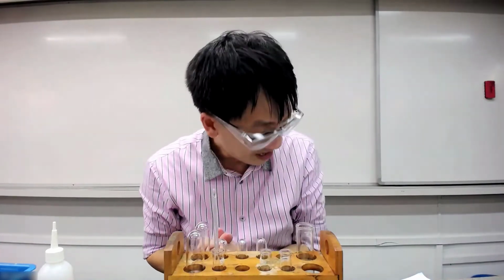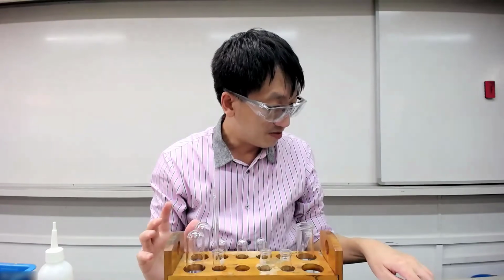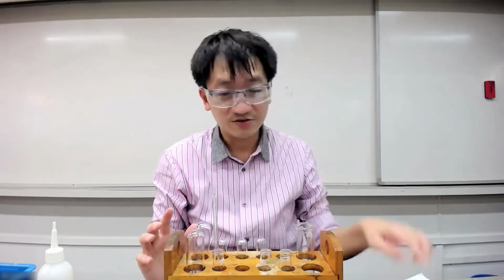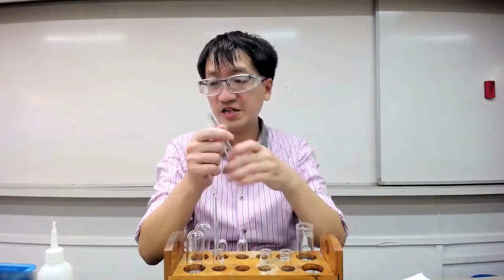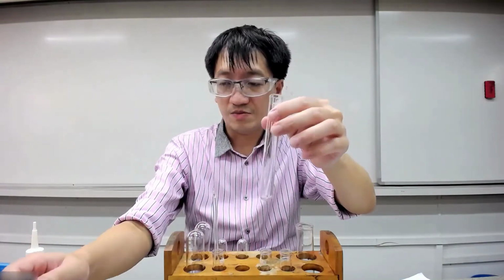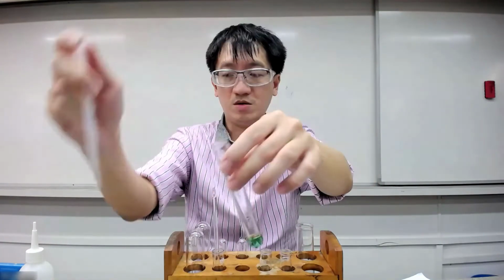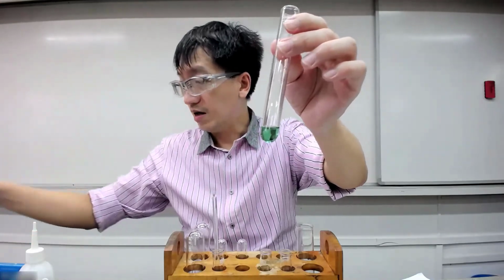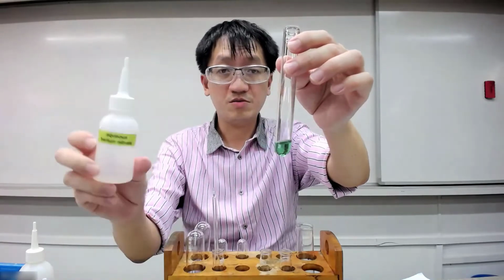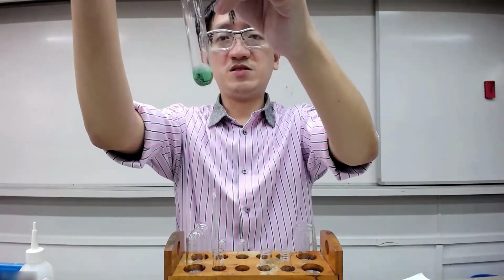Okay, so now for F part 2. Fa1 again, and then I'm supposed to add aqueous barium nitrate, and then add dilute nitric acid. So again, I'm going to add Fa1, then barium nitrate. So barium nitrate is over here. I'm going to add it dropwise. Again, please observe.